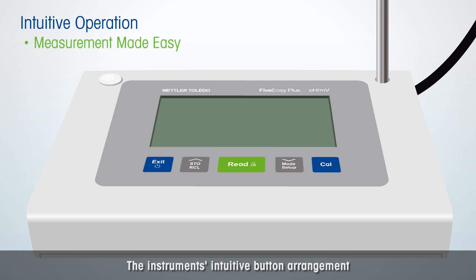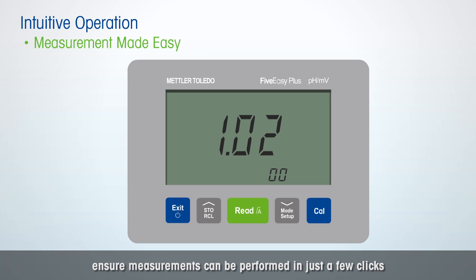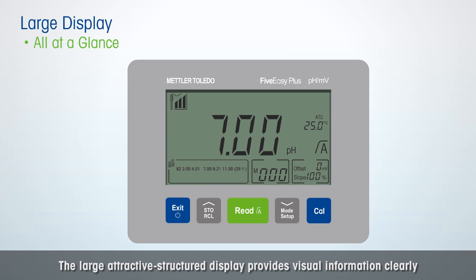The instrument's intuitive button arrangement and the user-friendly menu design ensure measurements can be performed in just a few clicks. The large attractive structured display provides visual information clearly.